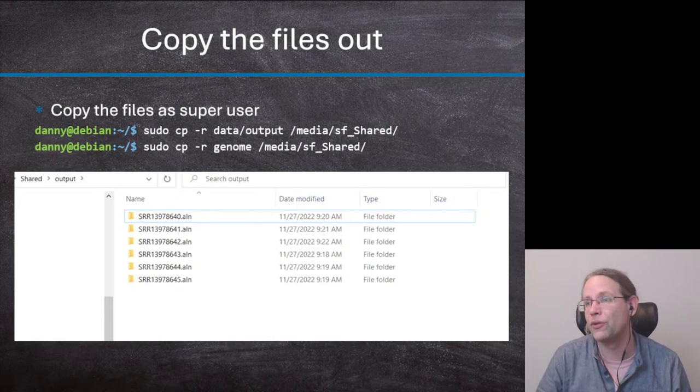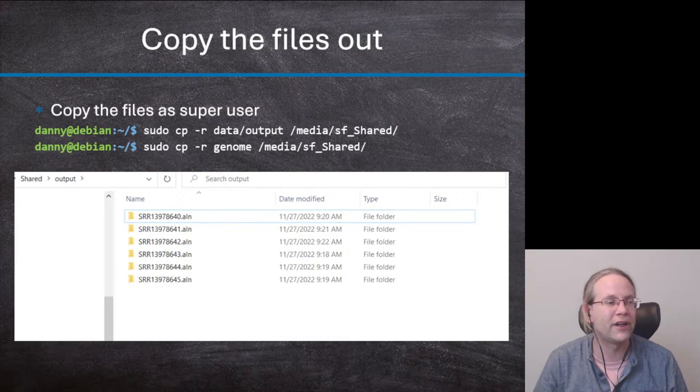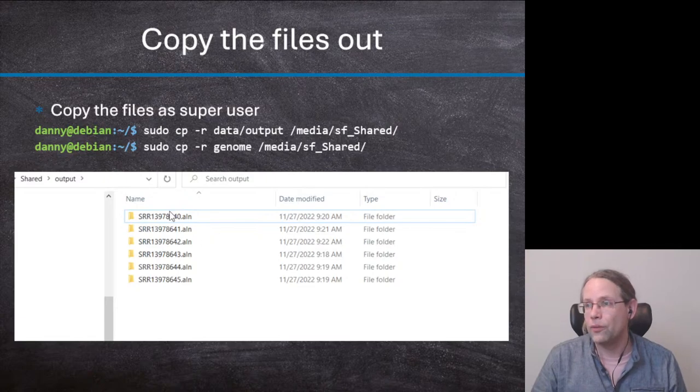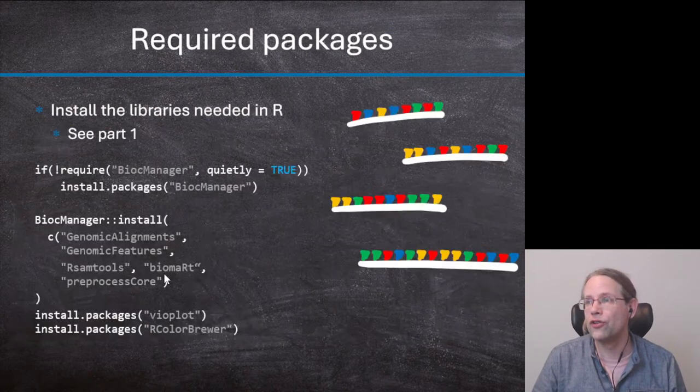I hope that at the end, everyone's able to make a really nice plot of their data, which shows the volcano, so the fold expression and the p-values. All right, so once you have these six files, we can start.